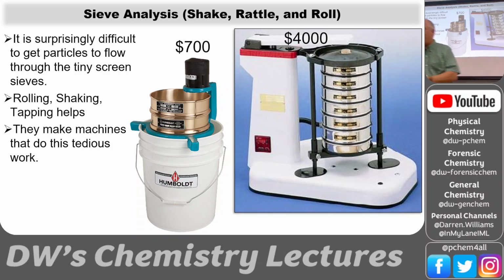And so these are the sieves. Pass these two around. I've only brought two, but you have a whole stack that you typically buy as a kit. Look on the side here. It says, let me see what it says.